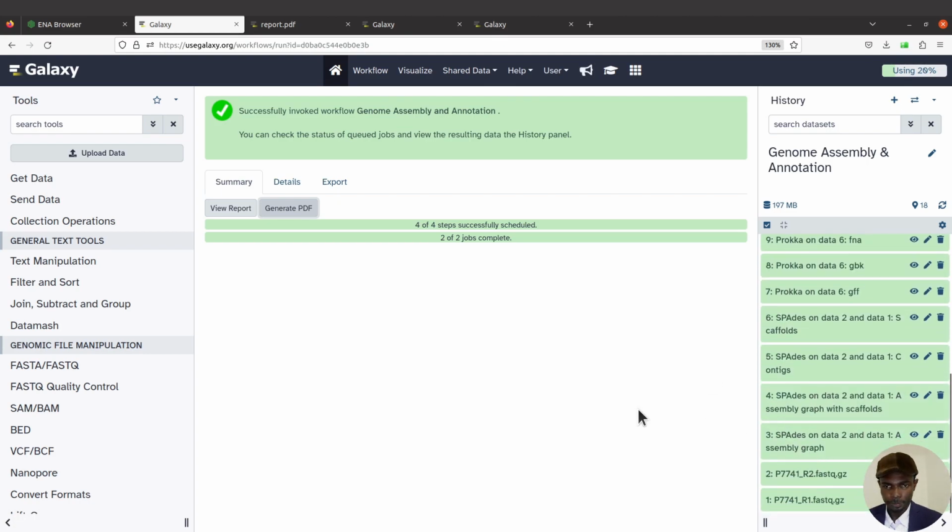Okay. So after performing your annotation, you can also visualize the annotation using JBrowse. There are things that you can do after you have generated your outputs for the annotation. Okay, so these are things that I've covered in our tutorial.